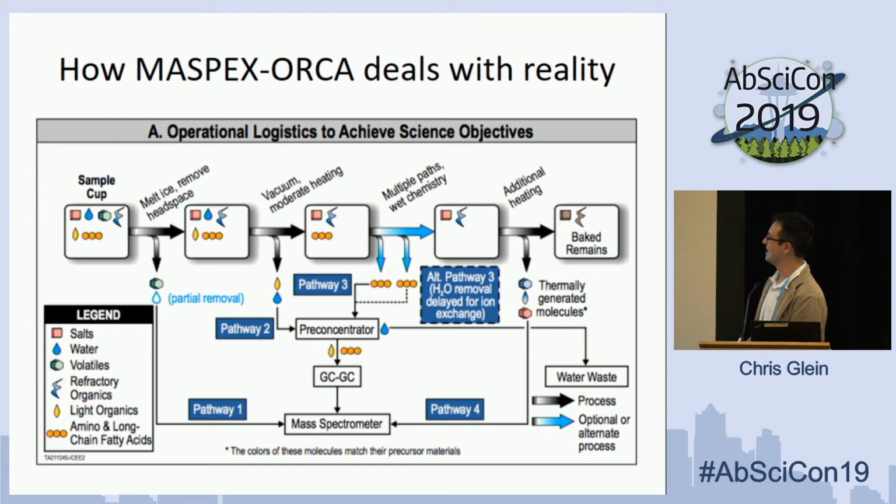That's step one. Then in the next step, you can envision starting to heat this mixture that's left over, and you can drive away the water. You can drive off some of the lighter hydrocarbons, like the gasoline-type hydrocarbons, and analyze those with a GC and a mass spec. And then we're doing this other development I'll detail in the next slide. We're exploring options for how we'd analyze amino acids using things like derivatization and salt removal. And the final part of this process leverages some of the development that people have done in the past, like the SAM investigation, where you just start baking this stuff, and then you can break off different pieces of this complex organic material, and you can learn something about its chemical character, which is really useful to know.